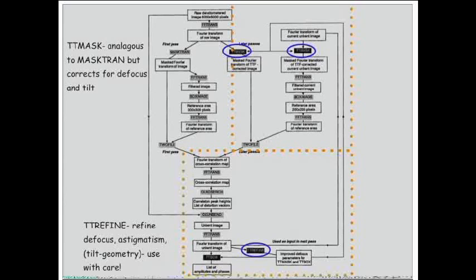You're going through cycles, and you're using TT-Box as a sort of diagnostic, like you would use MM-Box, looking at how the diffraction amplitudes increase in power as you go through cycles, and looking for an increase in good IQ values for your spots. Those are the diagnostics of image improvement as you go through cycles of refinement of defocus and astigmatism, and cycles of unbending.